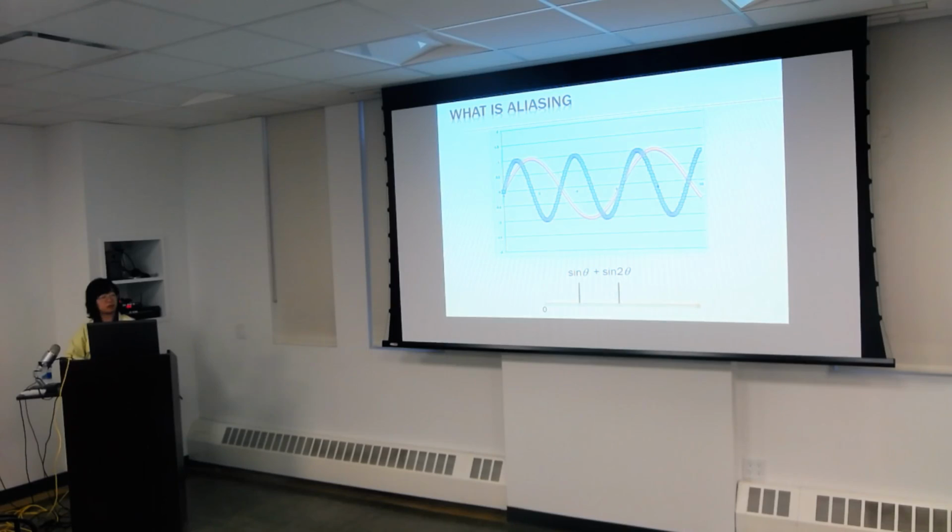So this is aliasing. You have a modification of what you can measure because of something that's outside your frequency cutoff. Because you have some signal outside your frequency cutoff that's contributing to what you are trying to describe, and it couldn't be described properly. So it's going to try to put that information in some other way that it can within the range. So this is aliasing.